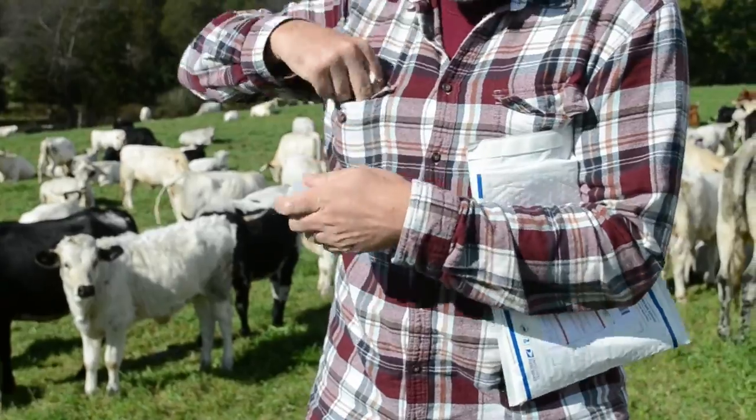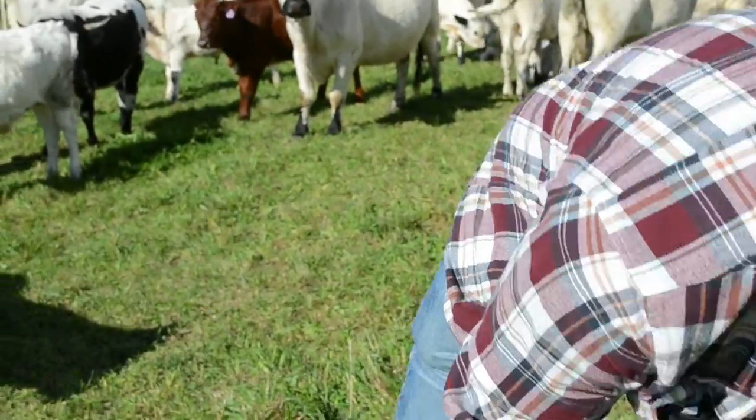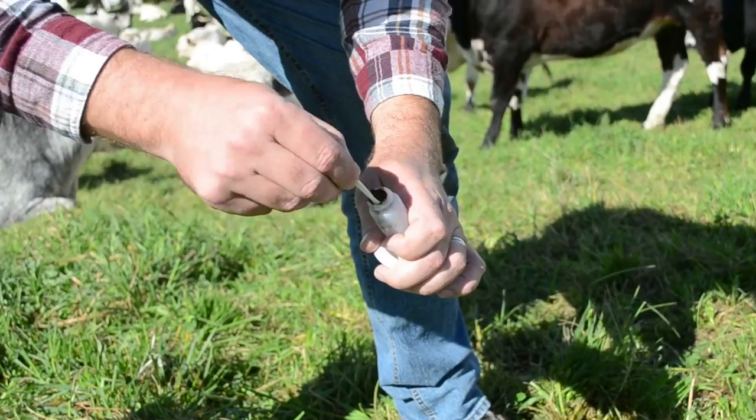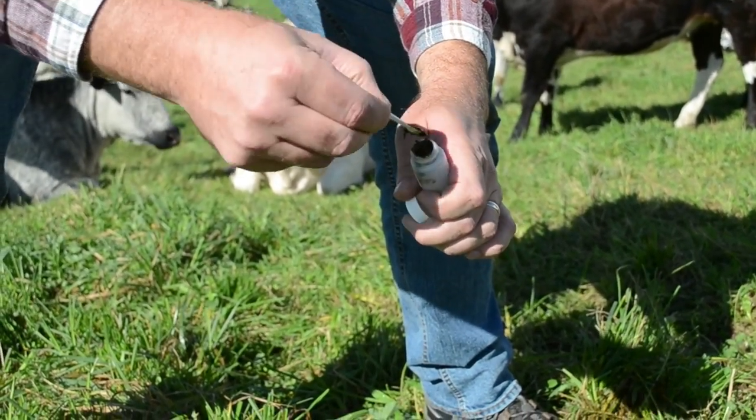Sample and mail early in the week to ensure quick delivery. Collect your samples in the morning from fresh cow patties. Sample three to four patties per tube. Collect scoops from larger cow patties, as these are more likely from the adult cows.